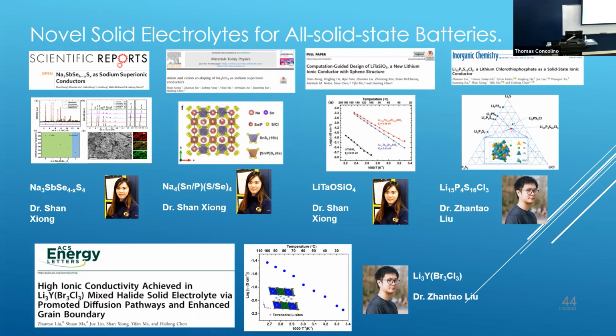We did try quite a few samples, because we also care about what's happening during cooling. The material we get after cooling is the material that we really use in batteries, right? But I would say half and half. Some materials, we even cool down, heat up again, and cool down again, for a few cycles. Some materials repeat themselves very well, so you always see the same transition at the same temperature, but some don't. As you cool it down again, you see different stuff.